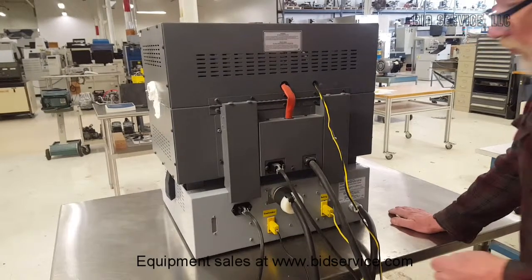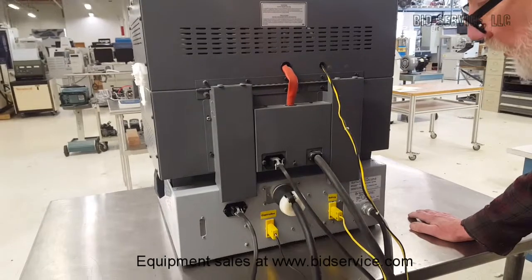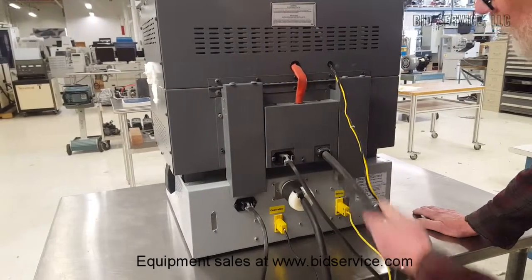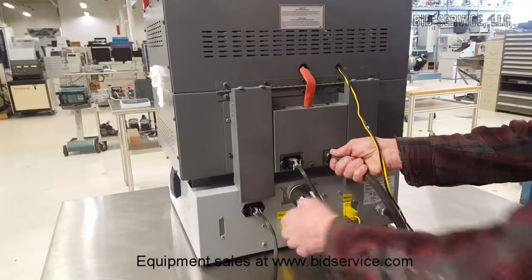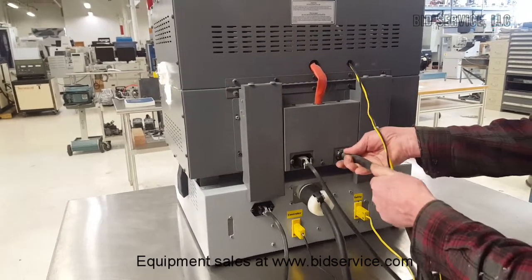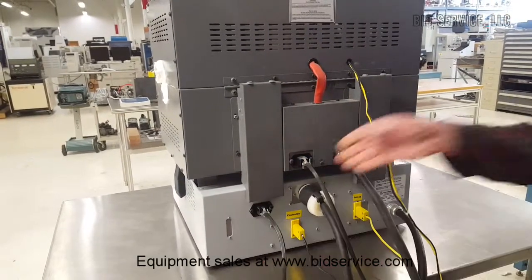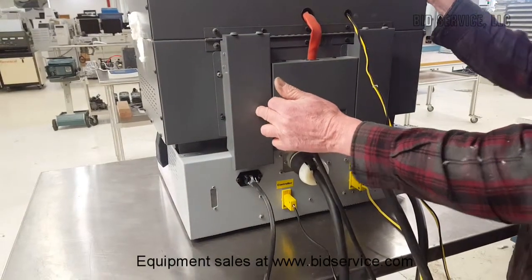Just to show you the rear connections: this is your main power line coming into the unit. There is a flying cable here that goes from the main unit to the heater controls, to the actual heating elements. This is a control line that is in place for the lid switch that must be made in order for the heaters to turn on.